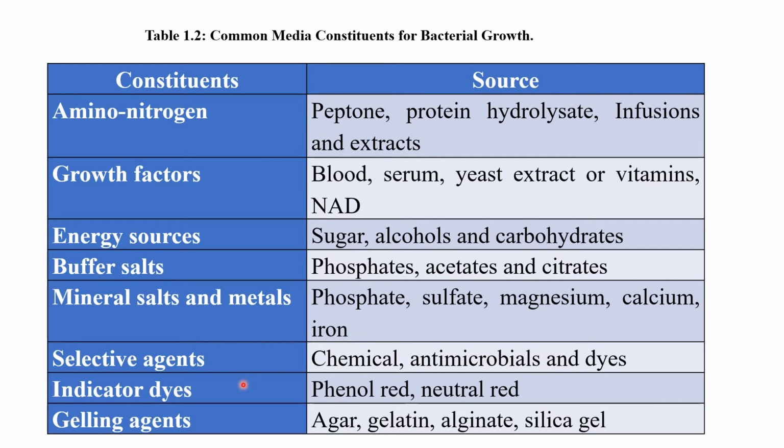Now, in addition to that, the gelling agent, which can act as a solidifying agent also, we can make use of either agar, gelatin, alginate, or silica gel. If we have added these sources within the medium, then the media will become solid.